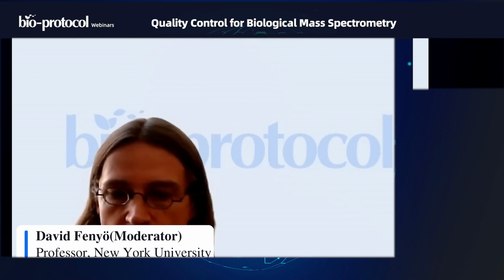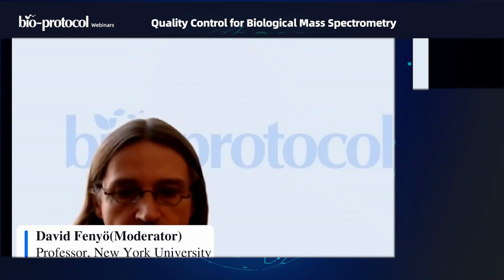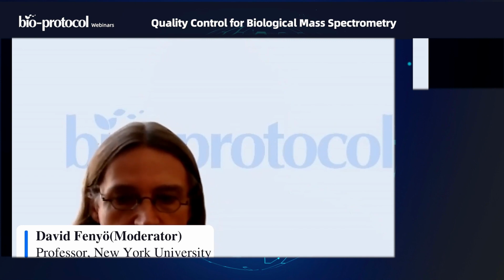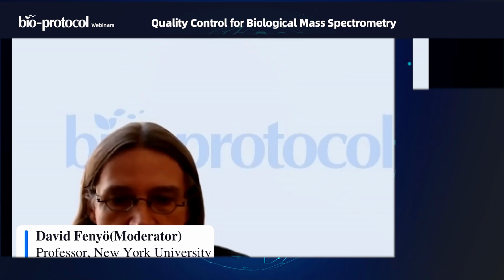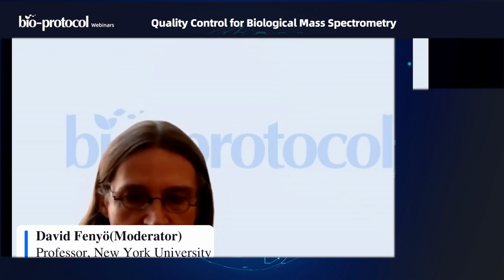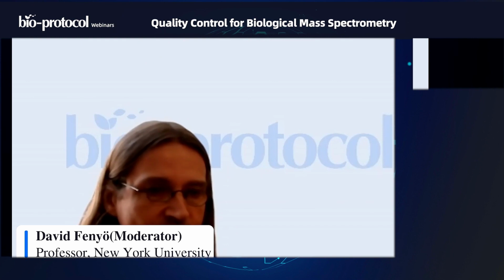So we can take another question about missing values in quantitation studies. What's your recommendation for how to deal with them, and what percentage would you recommend as the cutoff for how much missing can still be allowed? Okay, this is the question of missingness.